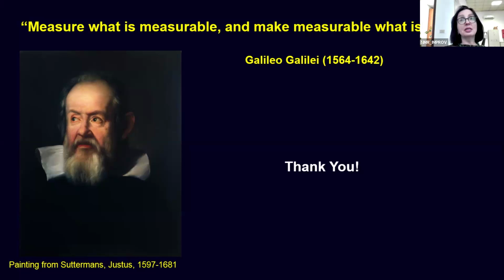If, for instance, the structure of the sample did not change, yeah, molecules usually do not change structure. However, I'm not able to keep, for instance, parameters like the dipolar relaxation constant temperature independent. This means that I'm also losing the plot, yeah? So somehow here we have some control. If you look in a broader way, we look for consistency of the analysis.